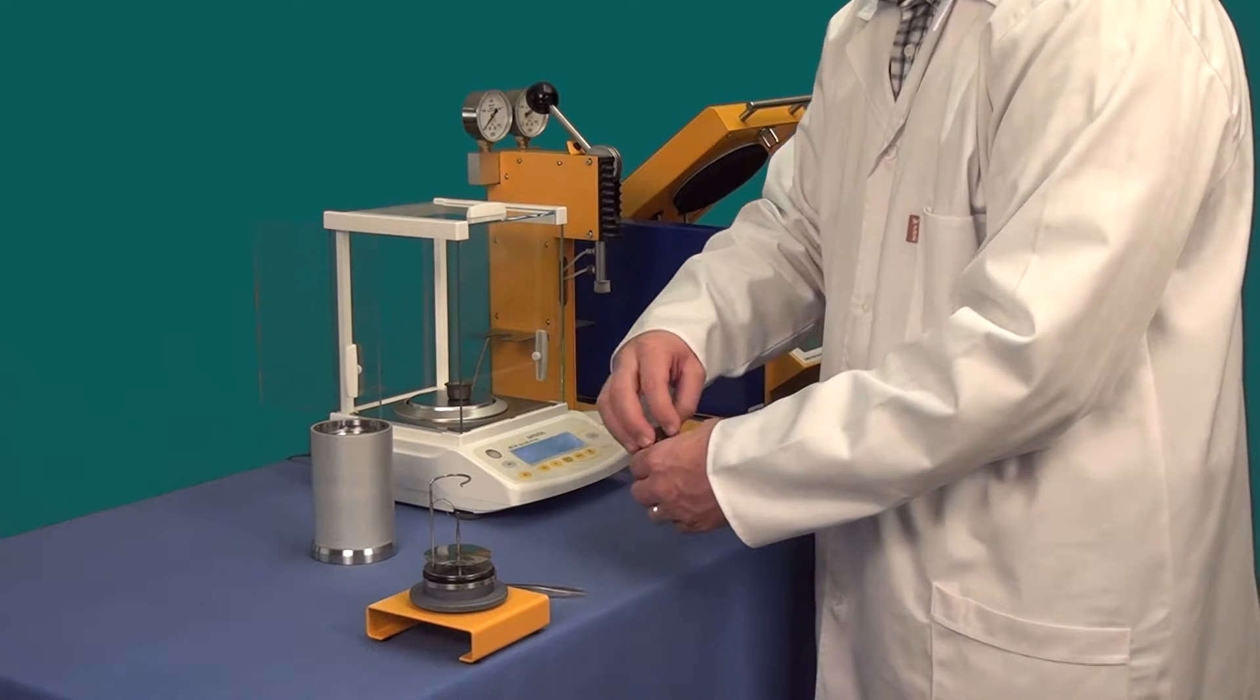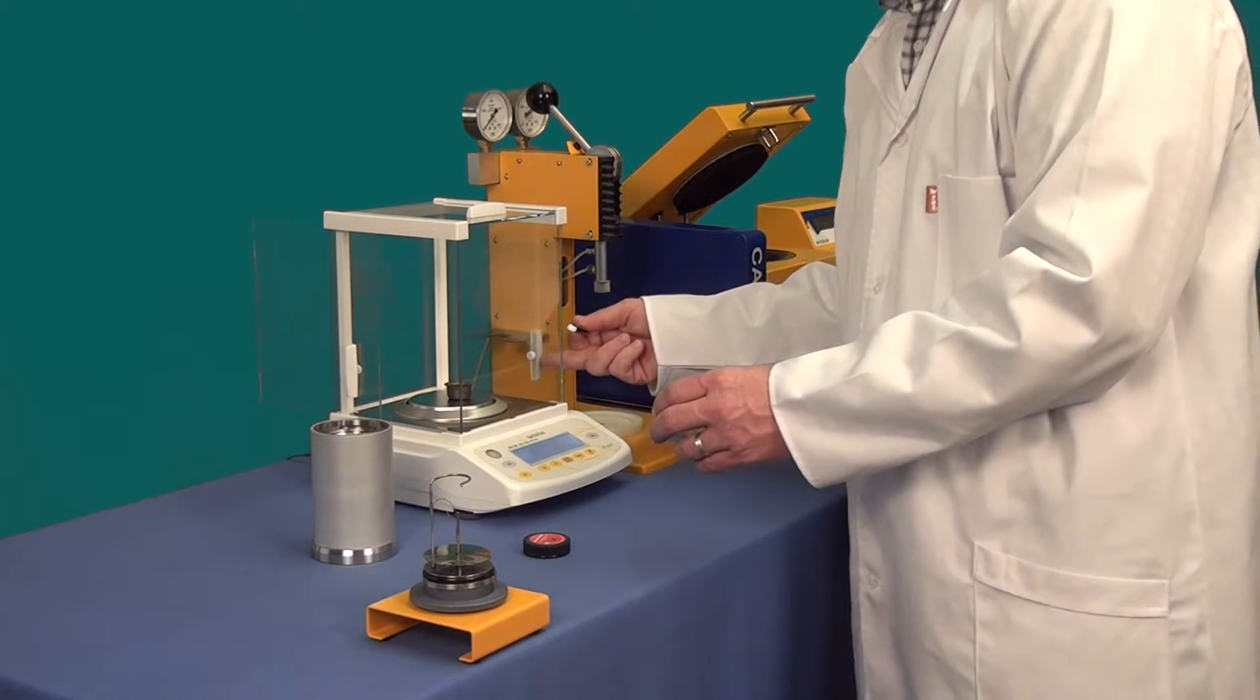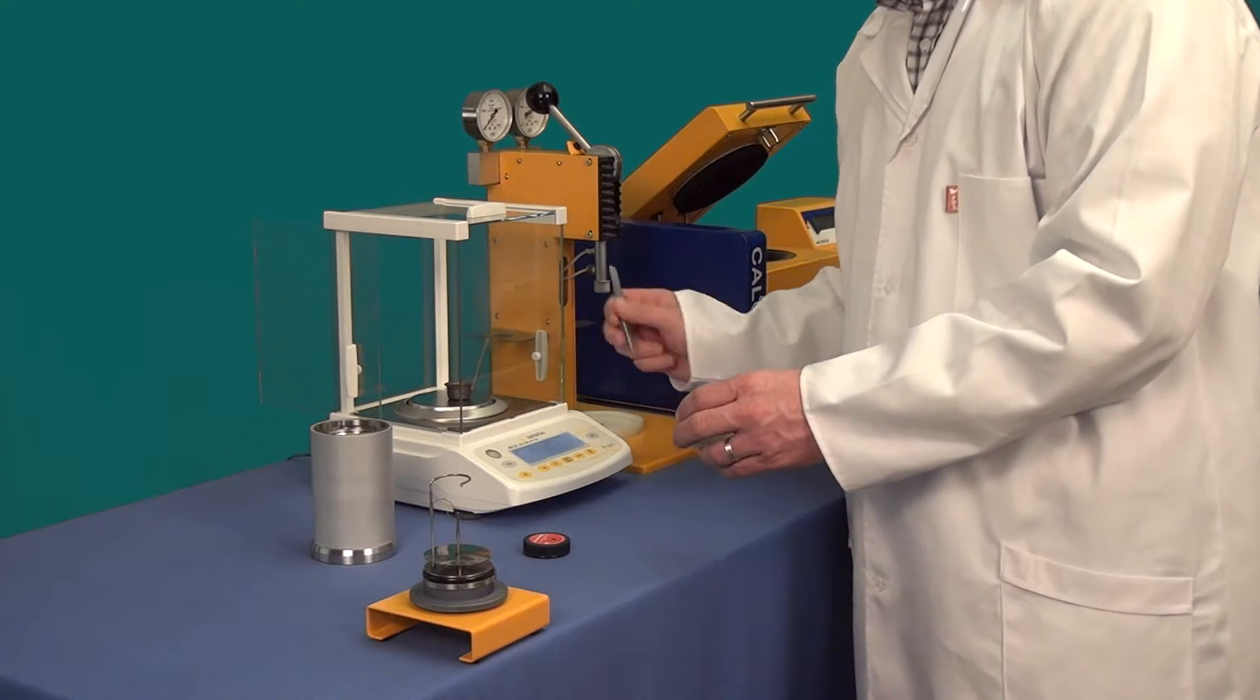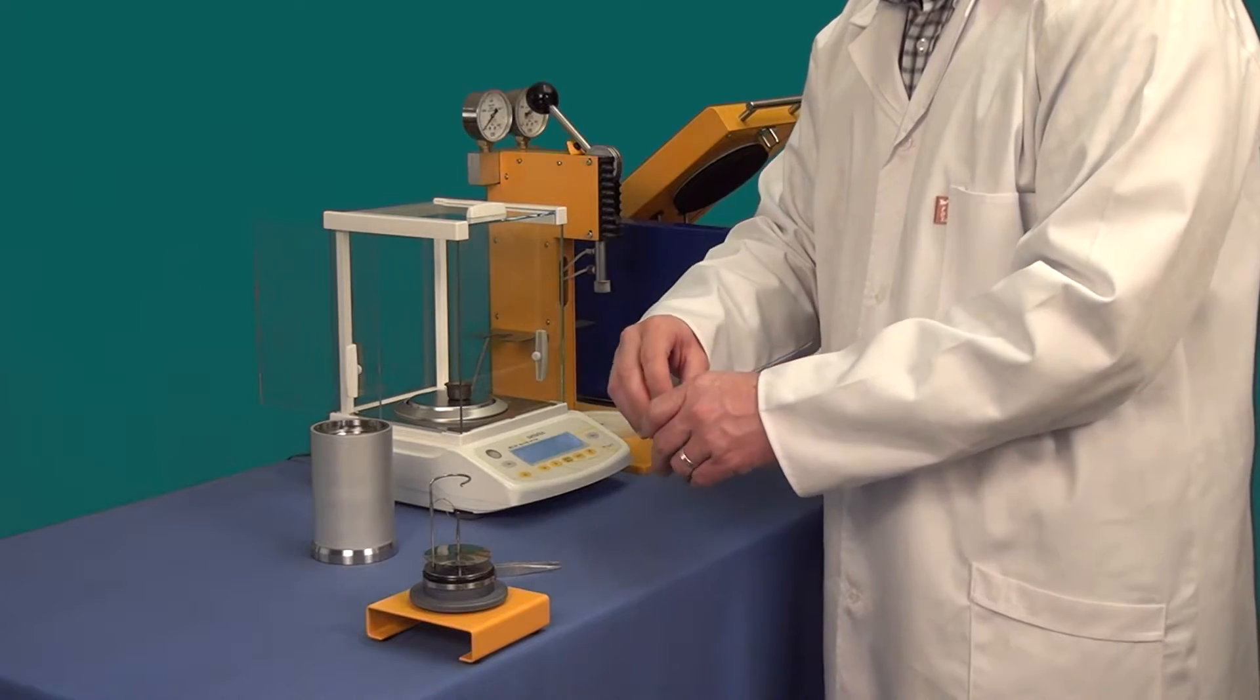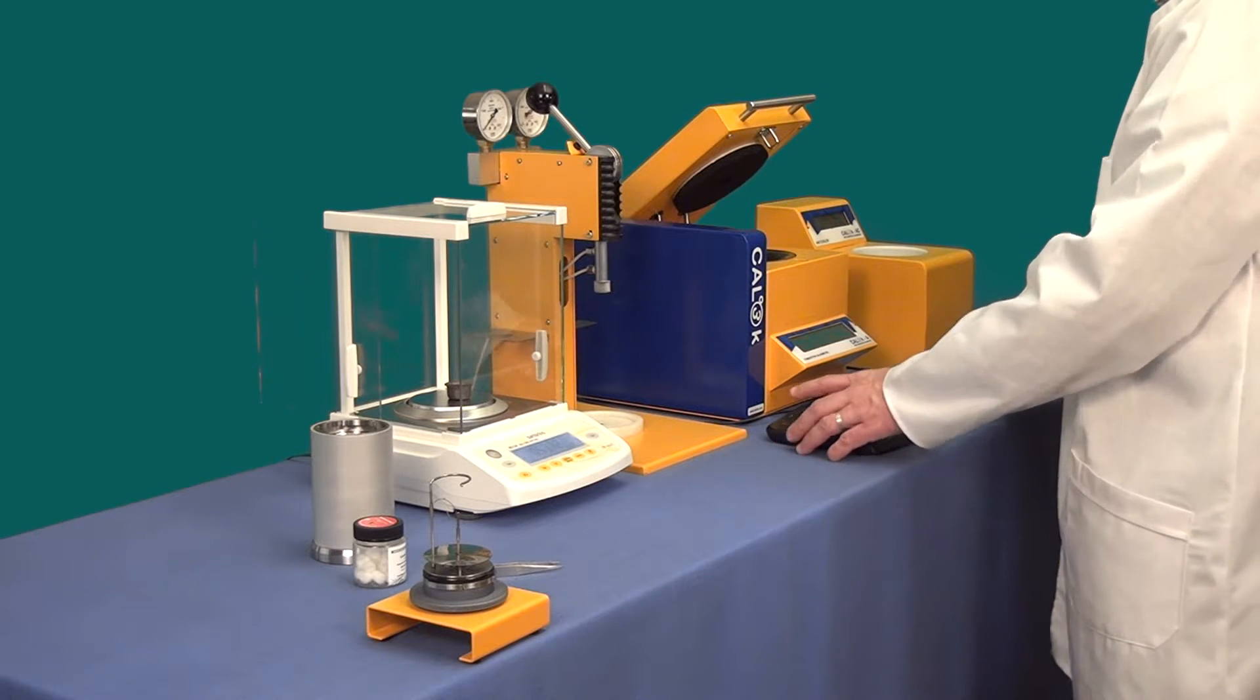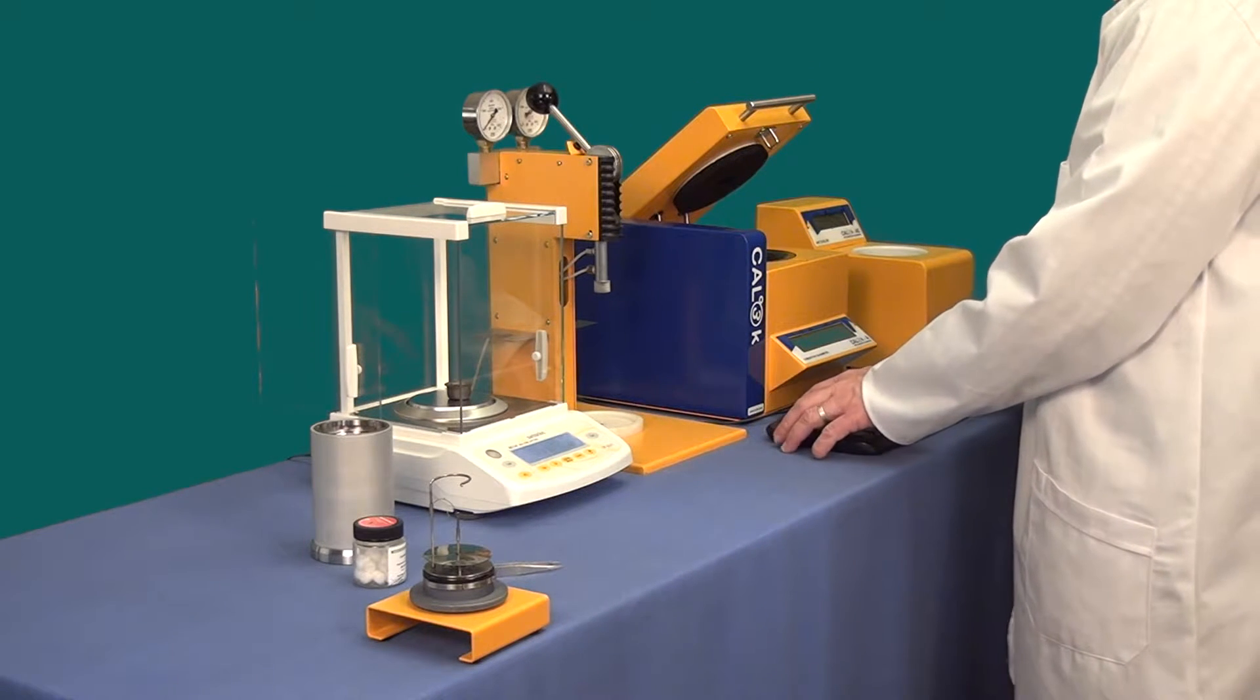Next we place a benzoic acid tablet of approximately half a gram into the crucible. Once the balance has stabilized we type in the mass into the calorimeter. The calorimeter does have the option of transferring the mass automatically from the balance.